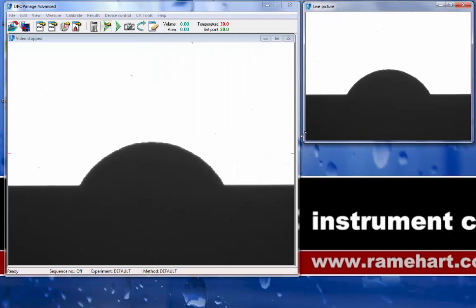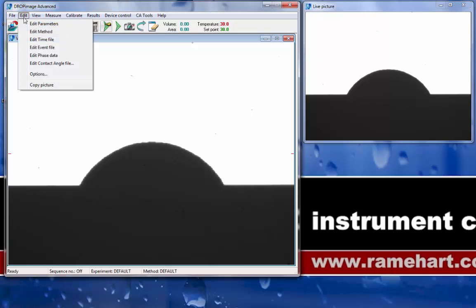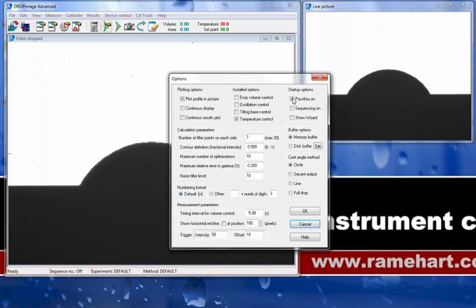If you prefer to work in two-window mode, you may choose to go to the Edit Options menu and set the default setting so at Startup, Pass-Through is automatically turned on.